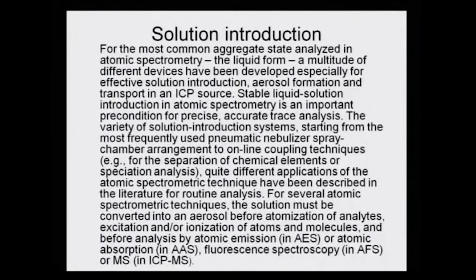Stable liquid solution introduction in atomic spectrometry is an important precondition for precise, accurate trace analysis. The variety of solution introduction systems, starting from the most frequently used pneumatic nebulizer and spray chamber arrangement to online coupling techniques, that is for the separation of chemical elements or speciation analysis, quite different applications of the atomic spectrometric techniques have been described in the literature for routine analysis.